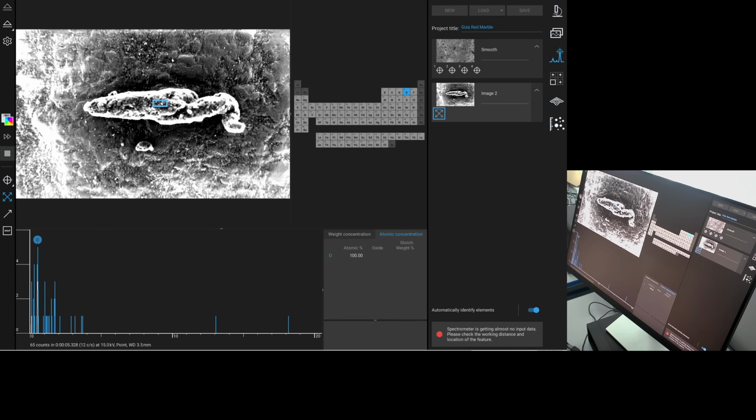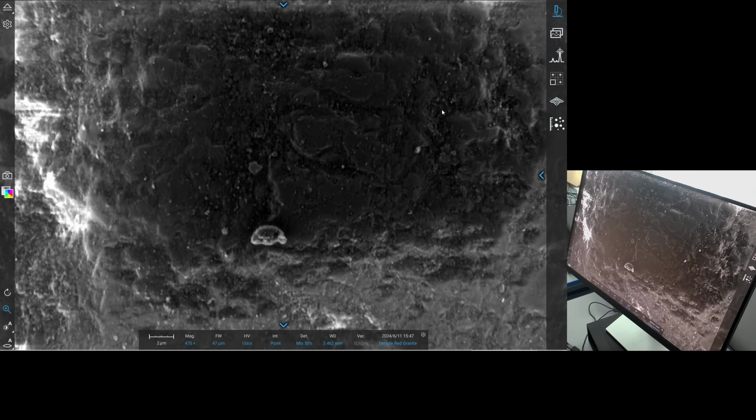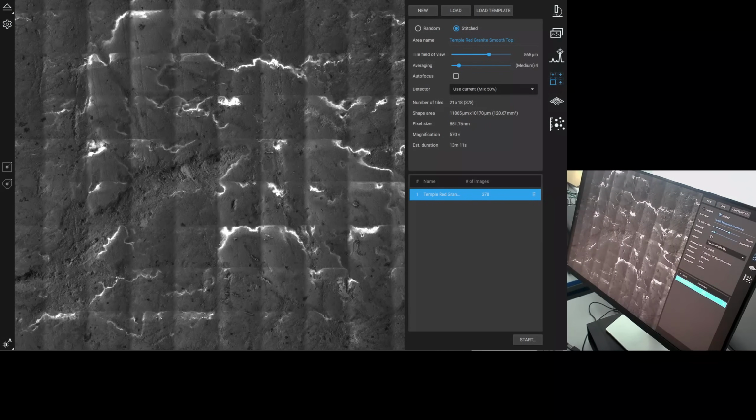Tantalizing though. It's a slug. It seems to have a piece going under there and around there. Let's see if any of the other ones are sufficiently far enough away. That moved. Did it move? I think it moved. I'm going to revisit some of these down here. There's quite a few down here.